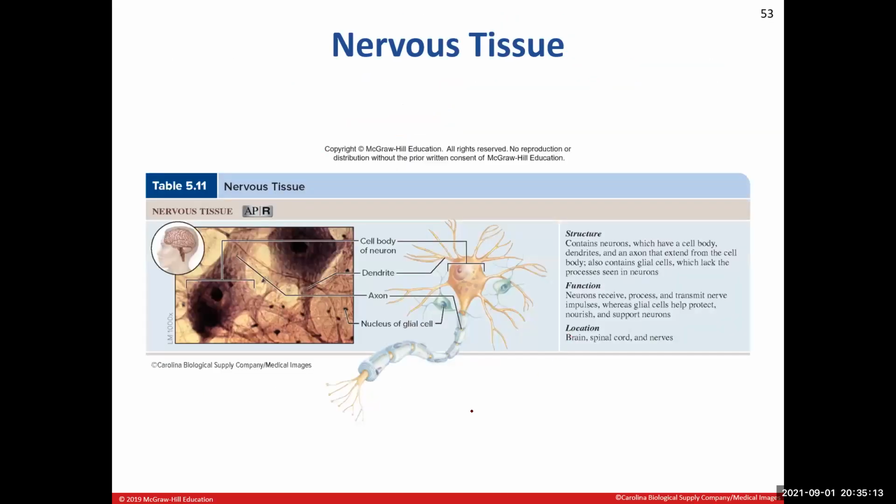So here you can see a picture of a neuron, and then it's got a couple glial cells, all right, in close proximity. So the neuron's an interesting looking cell. Okay, you've got this big bulbous end here with this long process coming off. And then you have all these little smaller arms coming off. And we'll talk about the different parts of a neuron. And then these smaller guys that are close by, these are the glial cells, those support cells. So this is the cell that transmits the information, processes it, receives the information, and then these cells just take care of them. Okay, it's important.